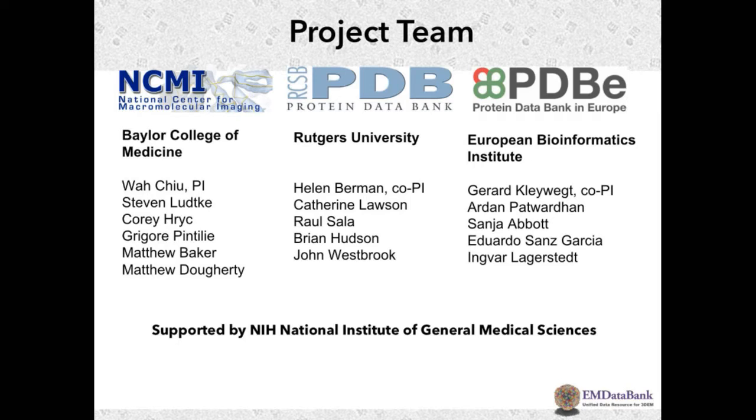It's a really different community too, between the people who participated in the map challenge and the people who participated in the model challenge. For the model challenge, there were a lot of people who developed software specific for crystallographic use, and they're modifying it to make it useful for Cryo-EM work.